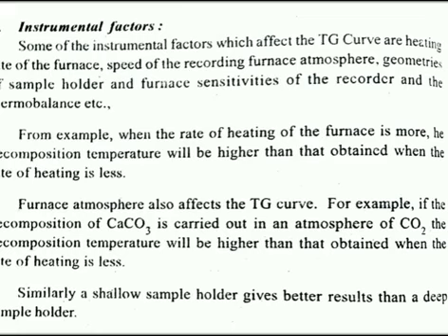So far we have discussed the characteristics of the thermogravimetric curve, the applications of thermogravimetric analysis, and the factors affecting the thermogravimetric curve. I hope you all understood whatever we have discussed in this class.